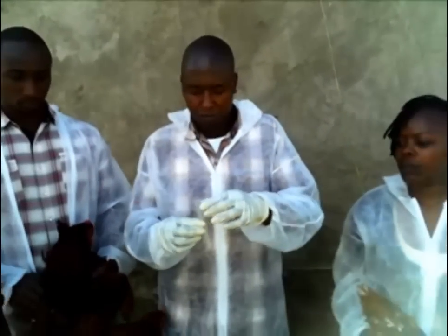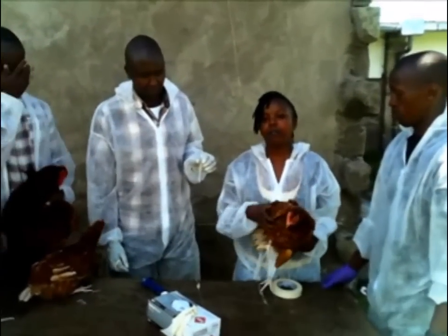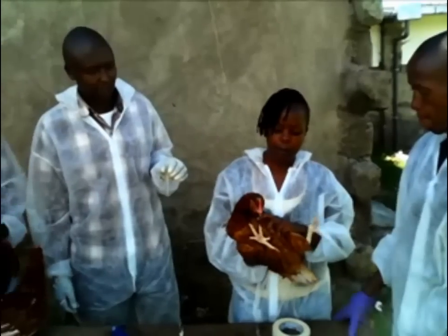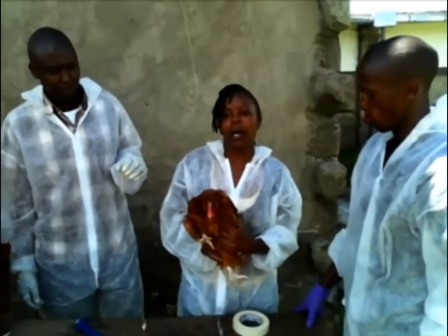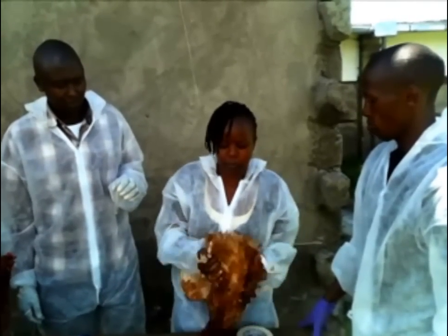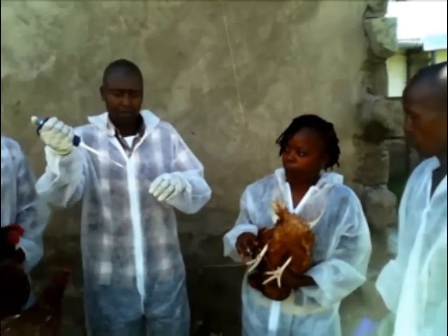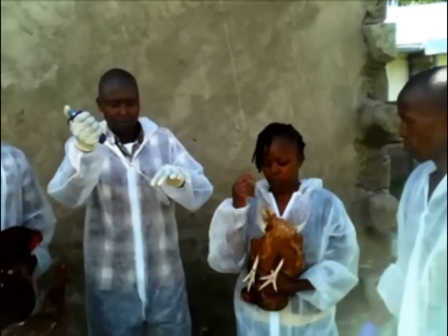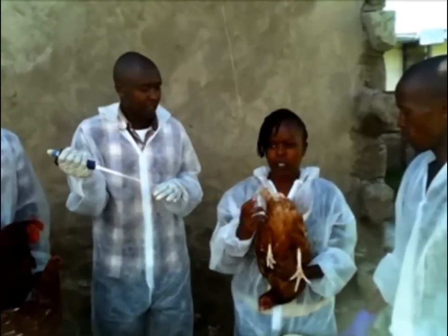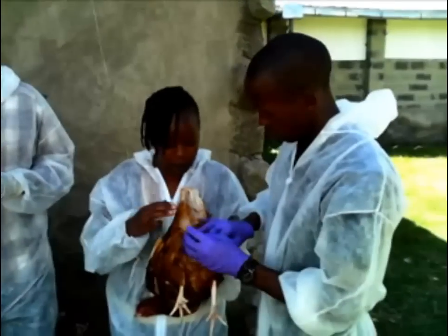Now we move to the section of the hen — the deposition of semen into the female. We will use the most commonly used method: vaginal insemination. This is supposed to be done by two people. One person is going to hold the female upside down with its back facing your stomach and with your legs in between. Then the second person should be ready with the pipette. We will only need about 0.1 ml for deposition of semen into the female. To deposit the semen into the reproductive tract of the female, we need to invert the cloaca so that we are able to expose the opening of the vagina and be able to deposit the semen.